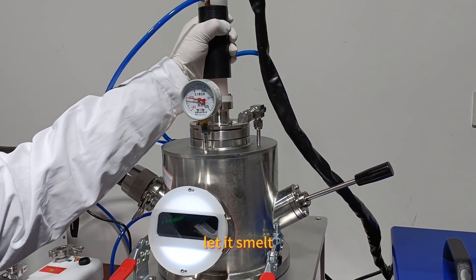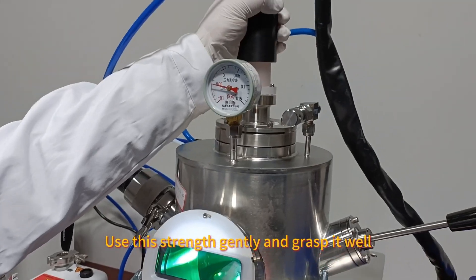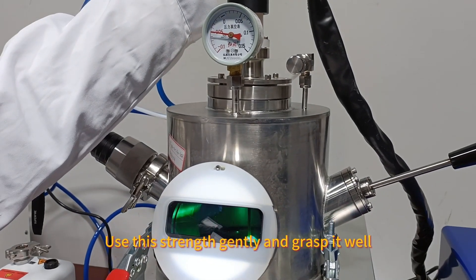Draw circular arc. Let it smelt. Use this strength gently and grasp it well.